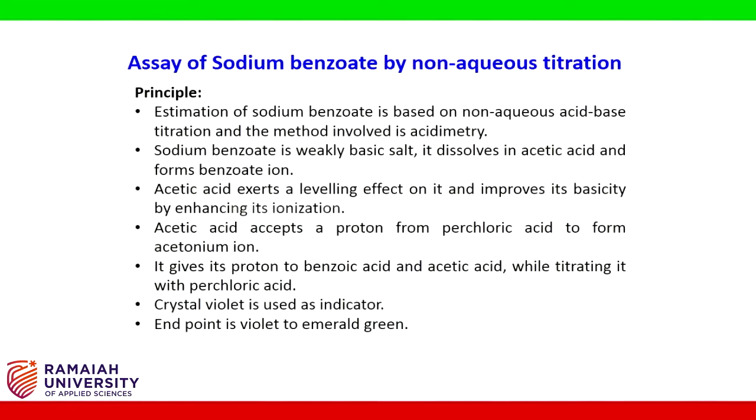Principle: estimation of sodium benzoate is based on non-aqueous acid-base titration and the method involved is acidimetry. Sodium benzoate is a weakly basic salt. It dissolves in acetic acid and forms benzoate ion. Acetic acid exerts a leveling effect on it and improves its basicity by enhancing its ionization.